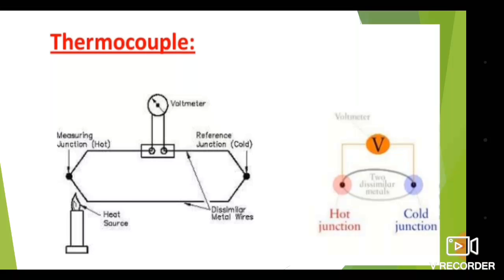Then we see how this thermocouple looks like. This is the measuring junction, the hot junction, and the heat source.